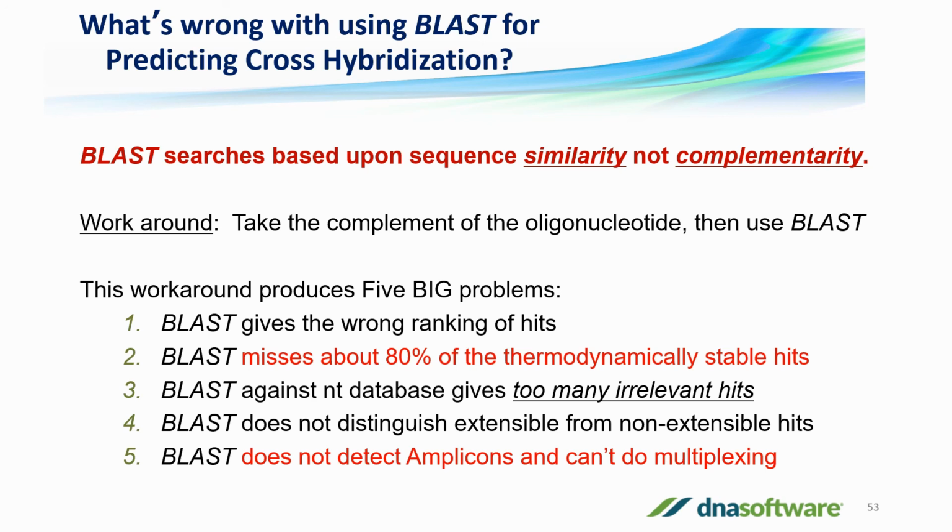Also, BLAST does not distinguish hits that are extensible by a polymerase from hits that are not extensible by a polymerase and are therefore not as problematic. It also doesn't detect amplicons that are formed by pairwise combinations of primers.